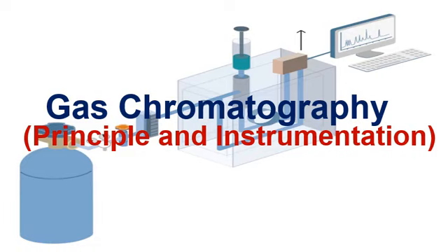So now, dear students, let us discuss how we can analyze a sample by using a gas chromatograph. Before discussing the analysis of the sample, it is very important to understand the essential components or basic parts of a gas chromatograph. Let us schematically draw the different components of a gas chromatograph. A gas chromatograph consists of a gas cylinder.